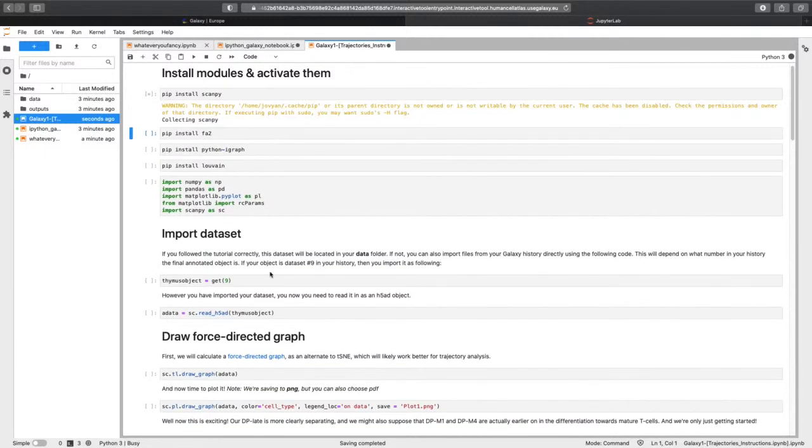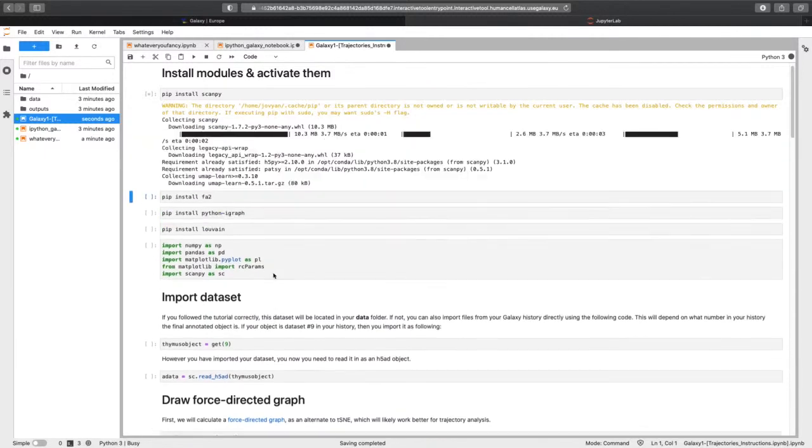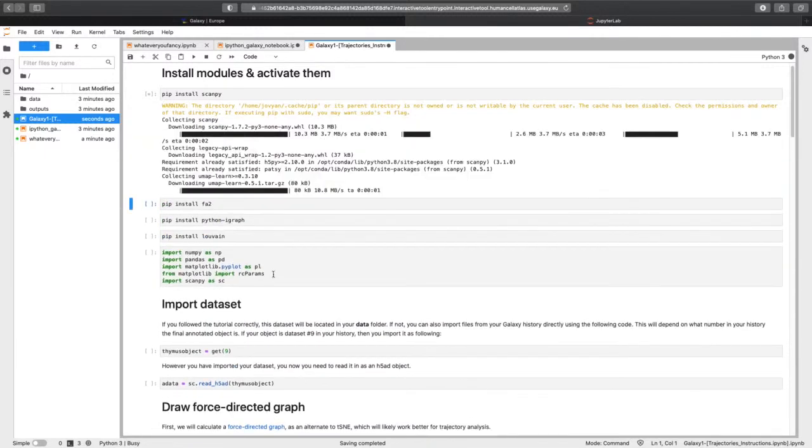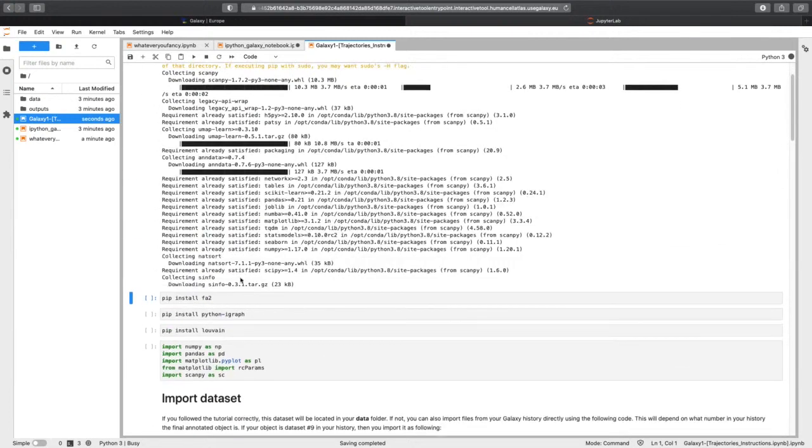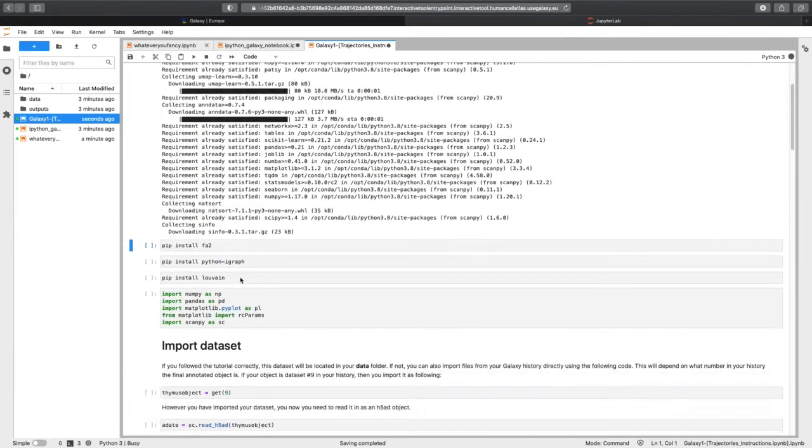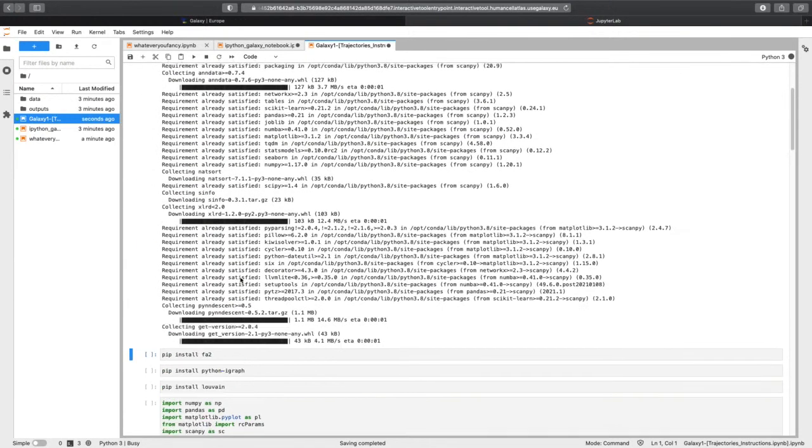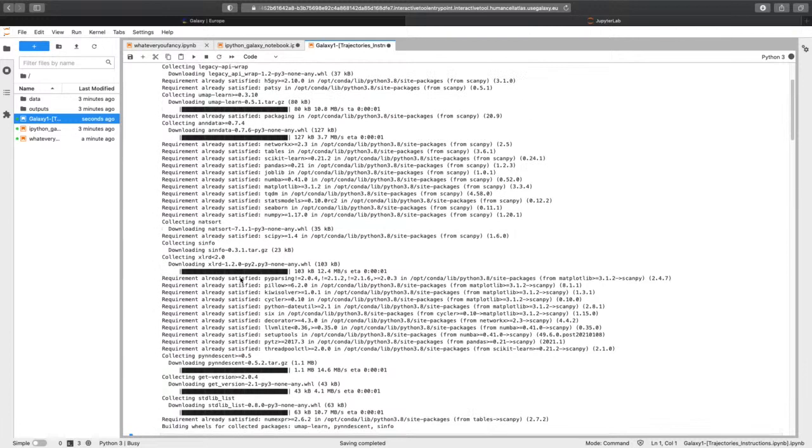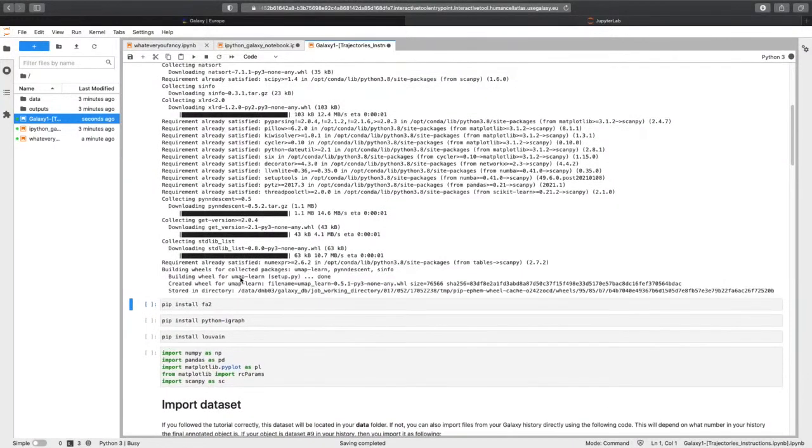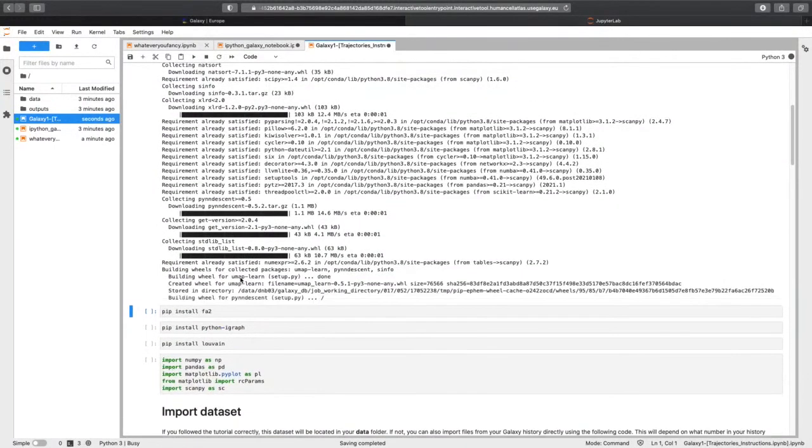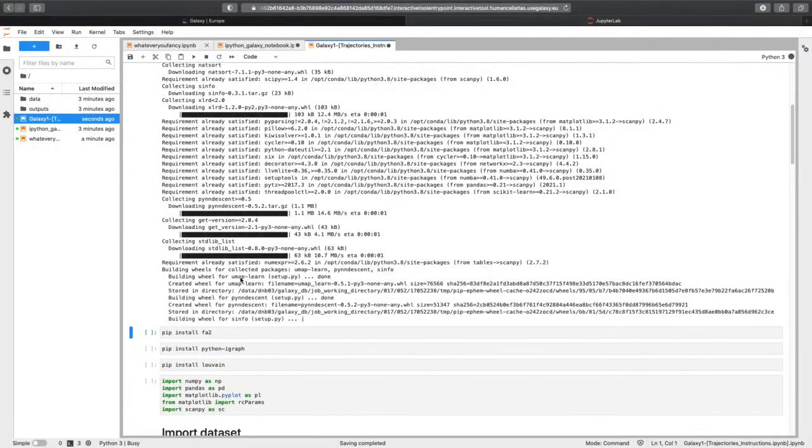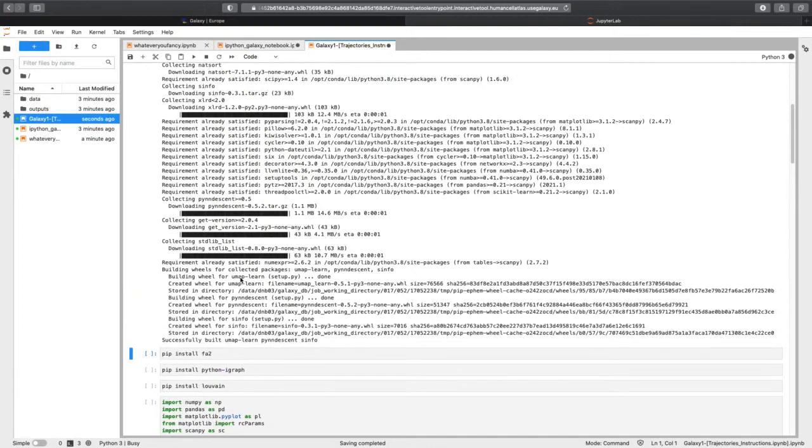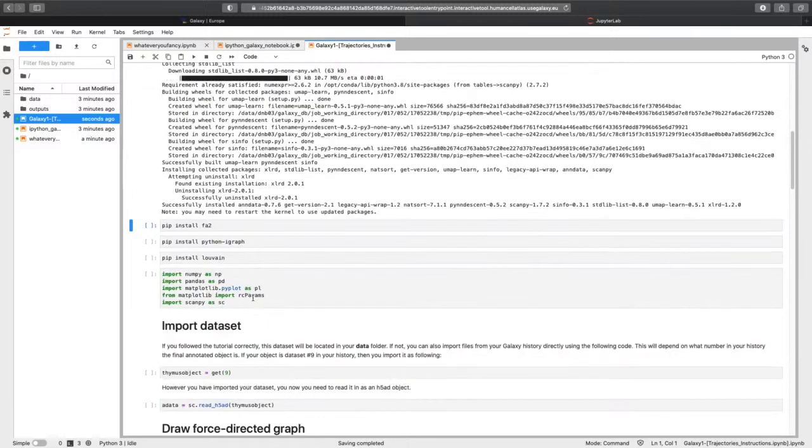And this is where you sort of transition from the Galaxy tutorial into a notebook tutorial, where it'll give you lots of lovely information about each thing. Because it's not wrapped in these lovely, wonderful Galaxy tools, it is using proper code, proper Python. You do have to install a few things at the beginning to make sure that your code will work.